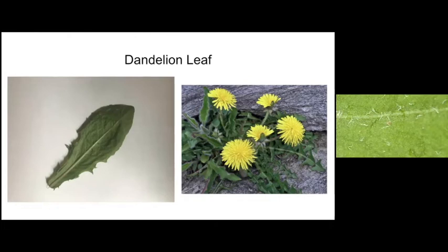That's pretty cool. What do you look at under your microscope? Stuff like blood cells and germs. What? I wish we had some of those. Some days I'm lucky enough and I'm able to put the slide into here, but some days I'm not. Let's see if today is one of those not days. Wow, so you have slides to look at too?